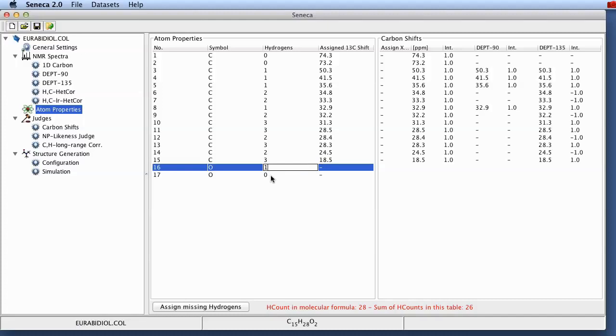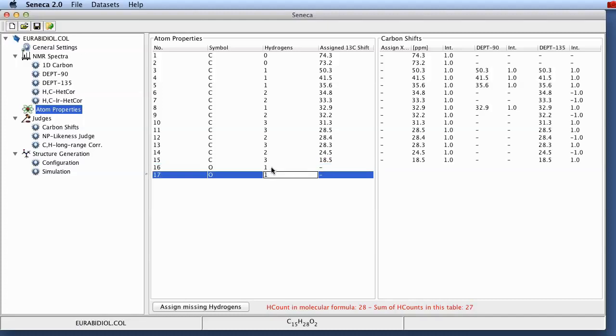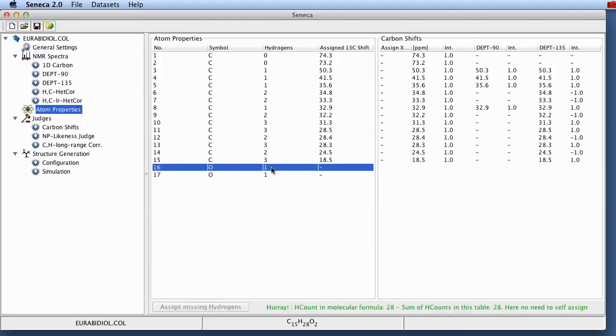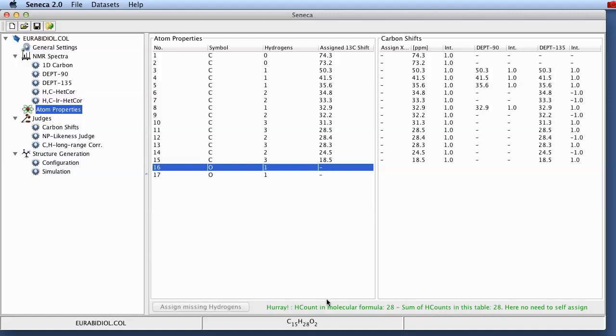This we have to do manually. In this case it could be easily done automatically but there are more complicated cases where the assignment is unclear. And in this case the user has to decide about the hydrogen attachments to heteroatoms. And as you can see here once we've done this the sum of the hydrogens in the molecular formula and the sum of the hydrogens in this table is equal. So there is no need to do any further work here.